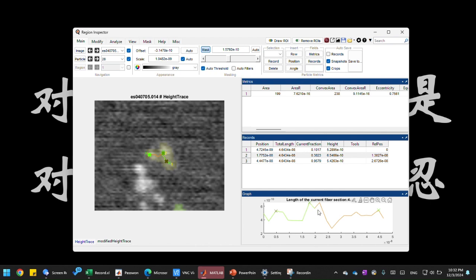And that's where the minimum separation comes into force, right? Even though these two peaks in the middle are symmetrical, they most likely have the same prominence. Yeah, they have the same prominence. But because they have the minimum separation set in the parameter in our profile, and they're too close to each other, only one peak is chosen. So that's very useful because they're essentially one floating domain, right? There are no two peaks, they're just one peak. So only pick one of them.